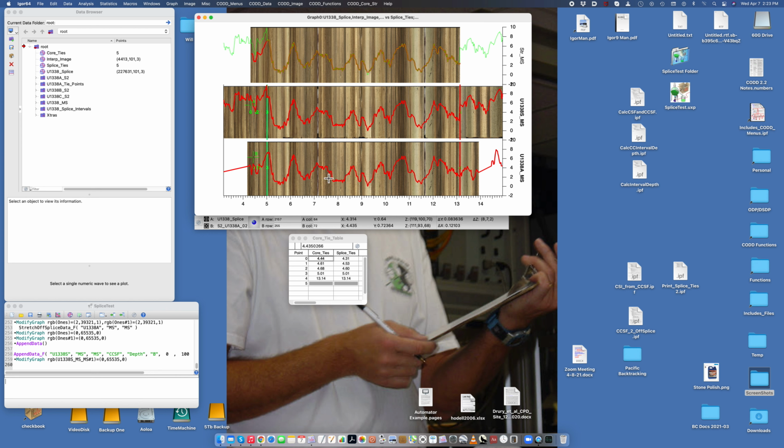And now you can take care of any fine points if you like. You might want to see where this data goes from sort of lightish to darkish. Here it's going lightish to darkish. Let's give that a try. Control 1, Control 2, Control 3, return. So now the light areas and the dark areas line up a little bit better. I don't know whether that's true or bogus.